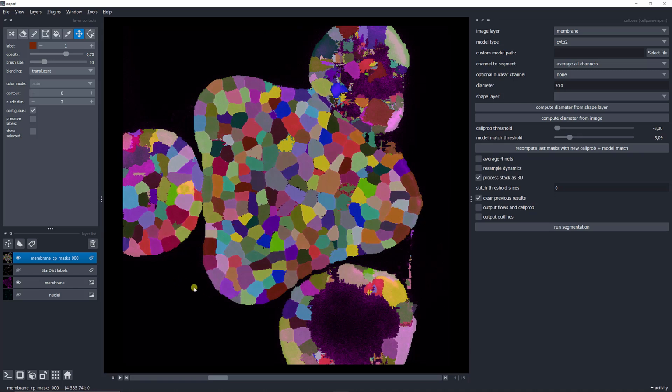And by the way, you cannot use Cellpose 3, which includes some denoising, because this plugin was designed before Cellpose 3 came out, and with Cellpose 3 it doesn't work. So you need to define it as Cellpose 2 actually, and that's why we had to reinstall. If you remember, when we did the plugin installation, we reinstalled Cellpose 2 afterwards, because otherwise the plugin doesn't work. So if you want to use the denoising and everything, you can process with Cellpose 3 as a command line or with other plugins, and then visualize it in Napari.